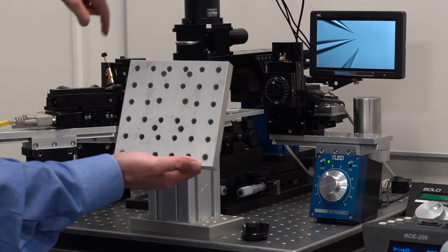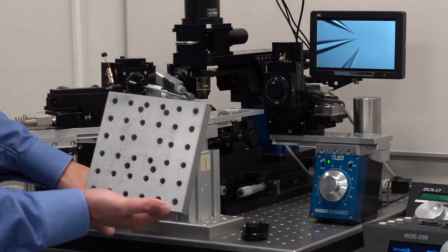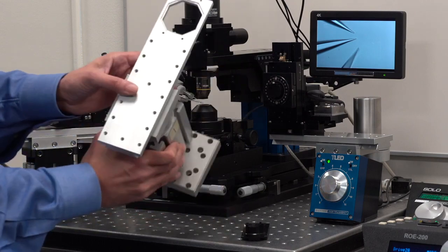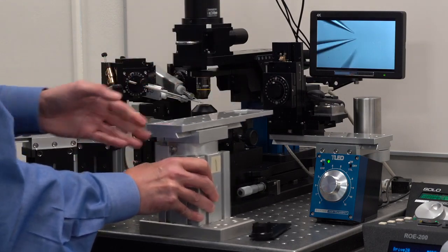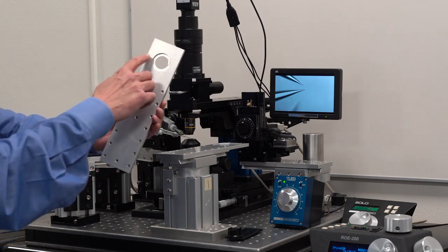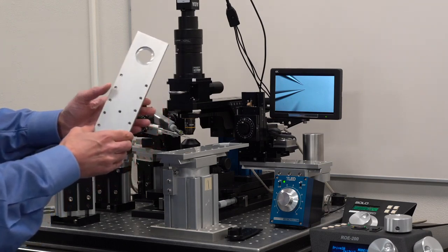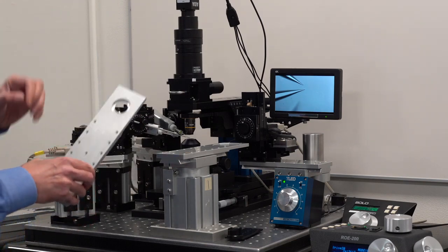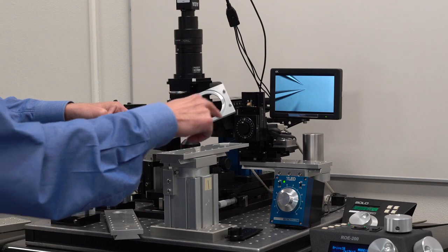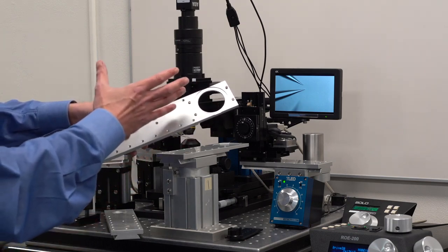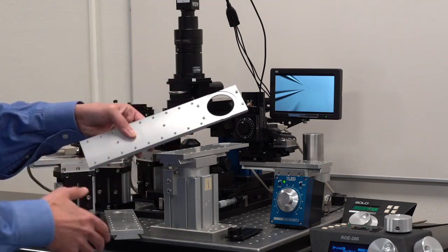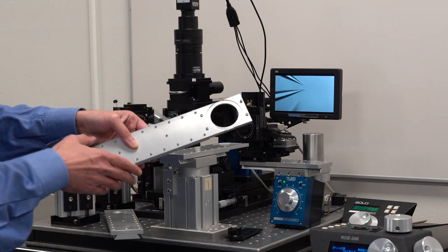Again, in this setup, with the crazy number of manipulators and such, I thought that the narrow format will be a better fit. In addition to this octagonal hole that we have, we have many, many, many different arms for these setups. I brought just a couple here. One of them was a very simple old, old 35mm petri holder. We make them a different size for different petries. And the one we sell the most is the one with the round opening here. We have a variety of them online. And if you have more questions, please contact Sutter. We have made custom ones for people as well as we might already have the answer you're looking.